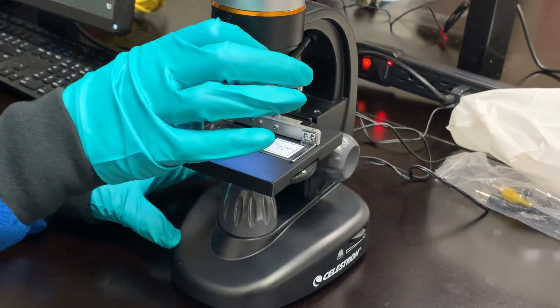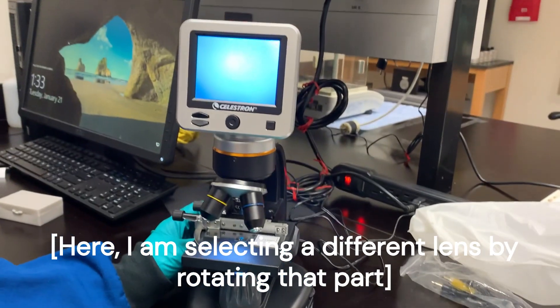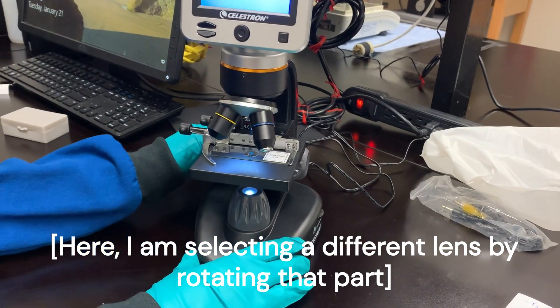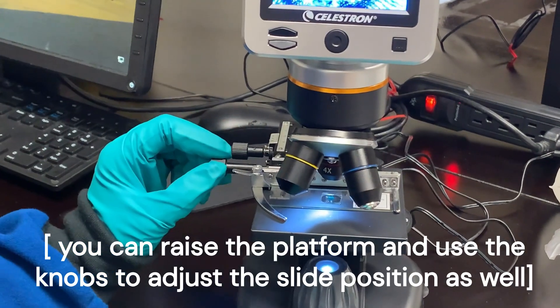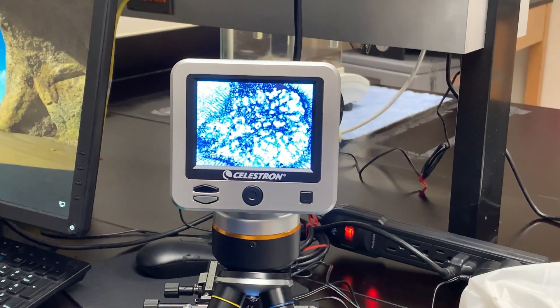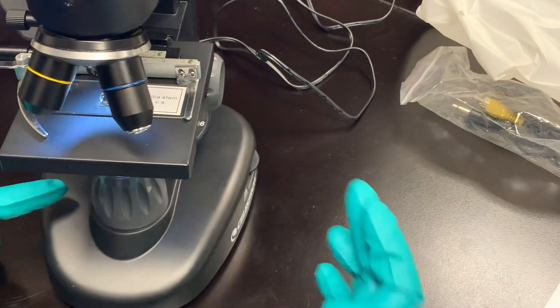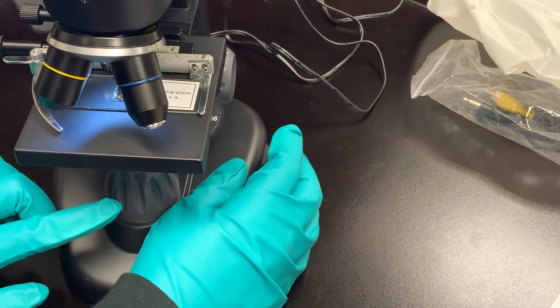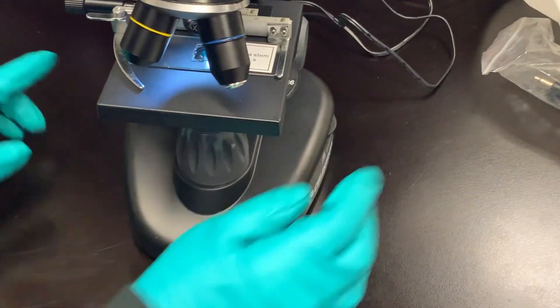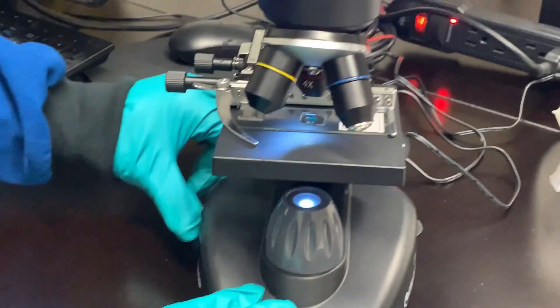I'm going to lower the intensity. Don't forget that you can use the knobs here to increase or decrease the light. The knob on the right adjusts the light below the platform, and the knob on the left adjusts the light above the slide.